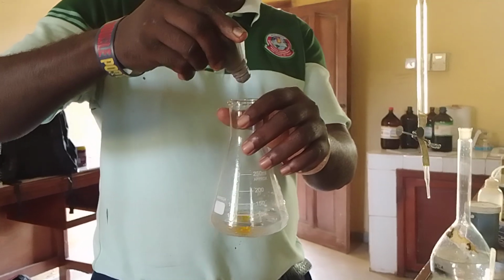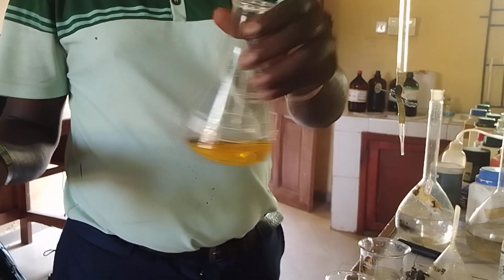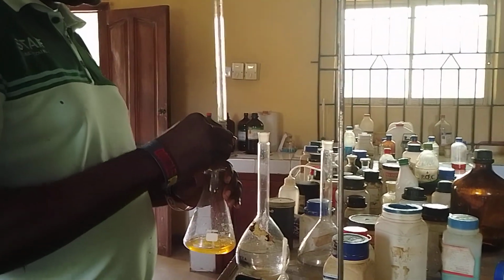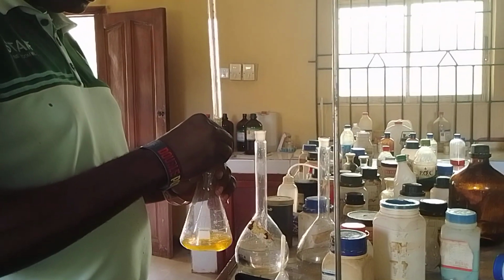Then my methyl orange, you can put 2 drops or 3 drops as the case may be. You can see that the solution has turned yellow. So I want to start titrating now. So I have to be releasing my acid inside here and be shaking.